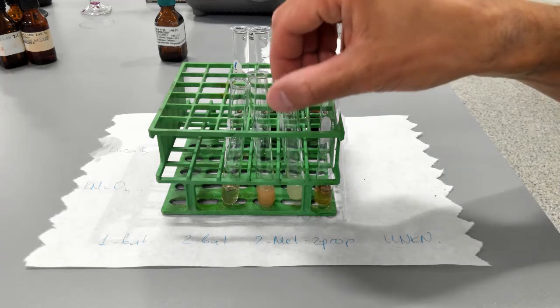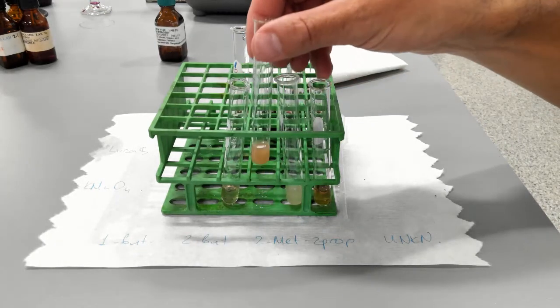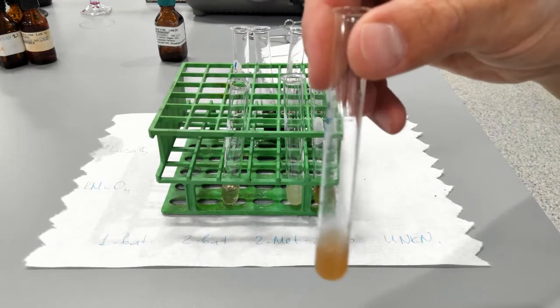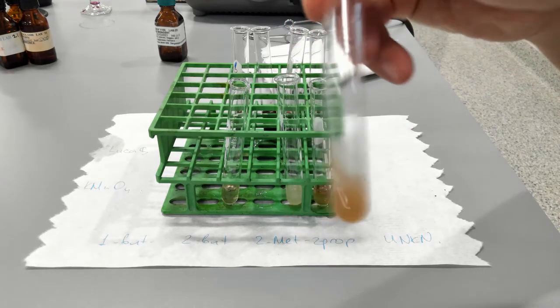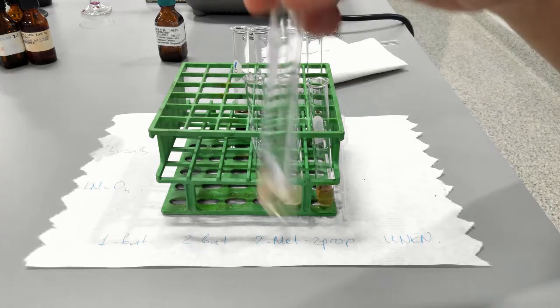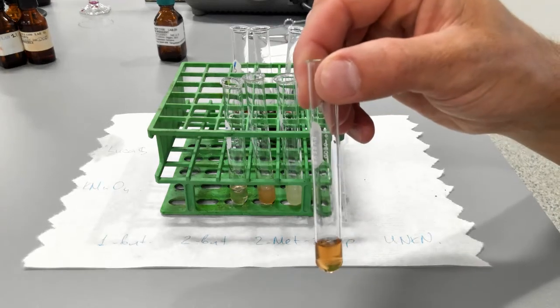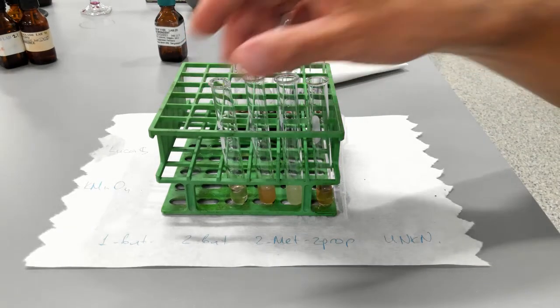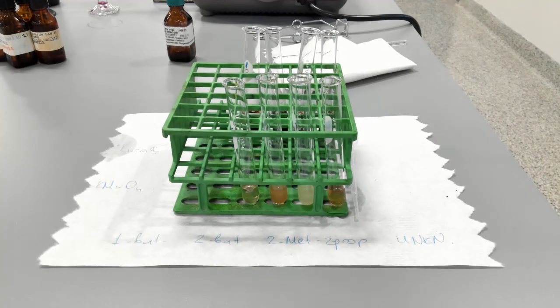This is the tertiary alcohol, obviously very, very cloudy. This is the secondary alcohol. After 15 minutes of heating at 60 degrees Celsius, you can see that it's cloudy. It slowly becomes more and more cloudy. And the primary alcohol and unknown remain clear. So basically here and here there's no reaction. So our unknown appears to be a primary alcohol.